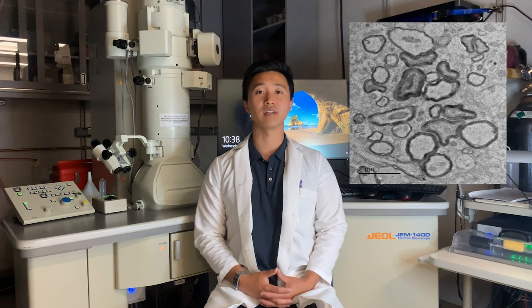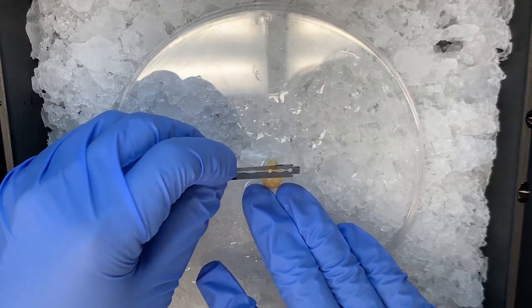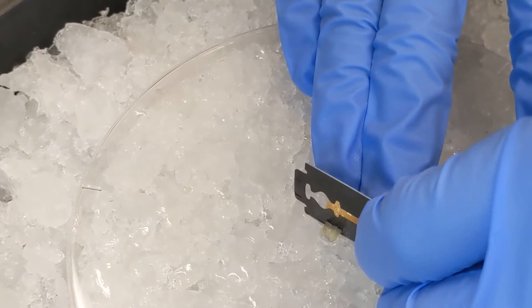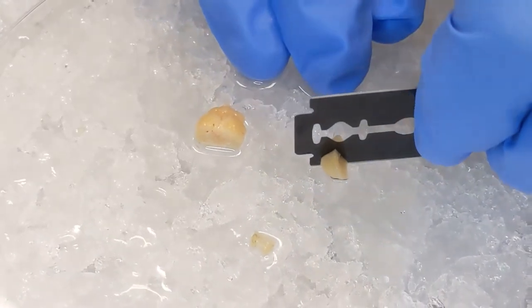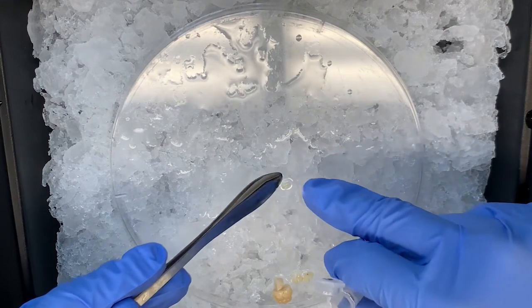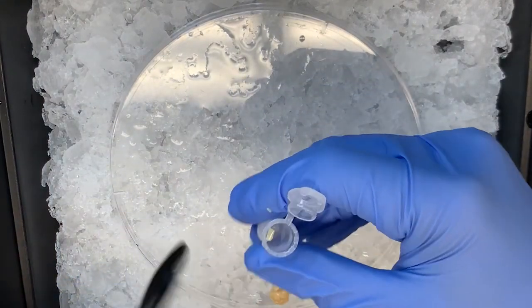Here, we will demonstrate the processing and imaging of the corpus callosum in a mouse brain by electron microscopy. After obtaining our fixed sample, we begin by isolating our region of interest. Although processing of larger samples is possible, as we're showing here, a brain matrix or vibratome is recommended to facilitate the collection of smaller samples. This will minimize the friction between the sample and the ultramicrotome knife in the preceding steps.